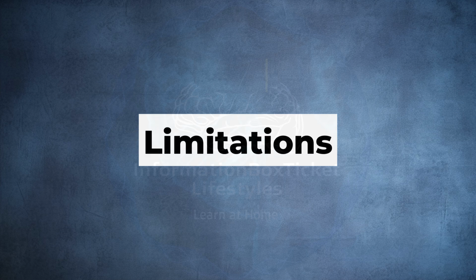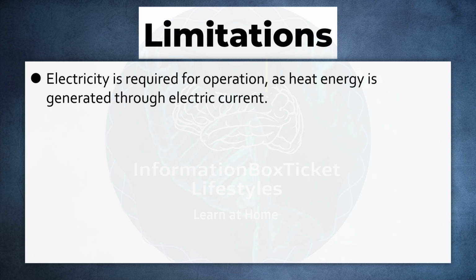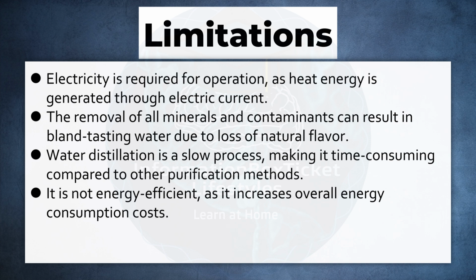Limitations of water distiller. Electricity is required for operation, as heat energy is generated through electric current. The removal of all minerals and contaminants can result in bland-tasting water due to loss of natural flavor. Water distillation is a slow process, making it time-consuming compared to other purification methods. It is not energy efficient, as it increases overall energy consumption costs.